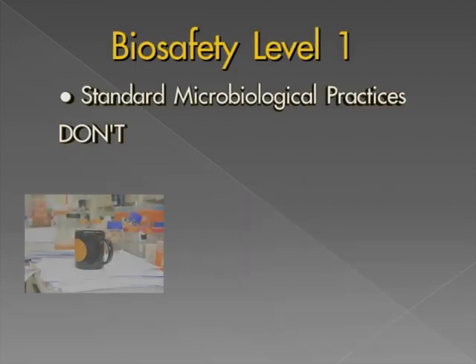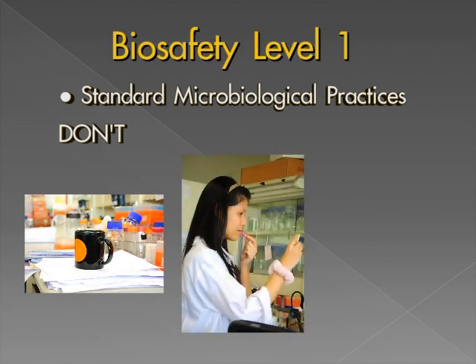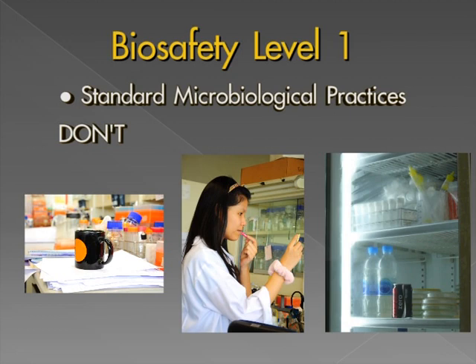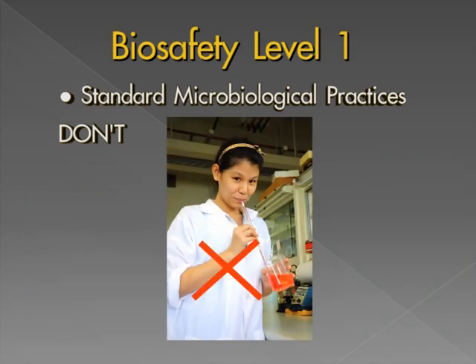Don't. Eating, drinking, smoking, handling contact lenses, applying cosmetics, and storing food for human consumption must not be permitted in laboratory areas. Food must be stored outside the laboratory area in cabinets or refrigerators designated and used for this purpose only. Mouth pipetting is prohibited. Mechanical pipetting devices must be used.